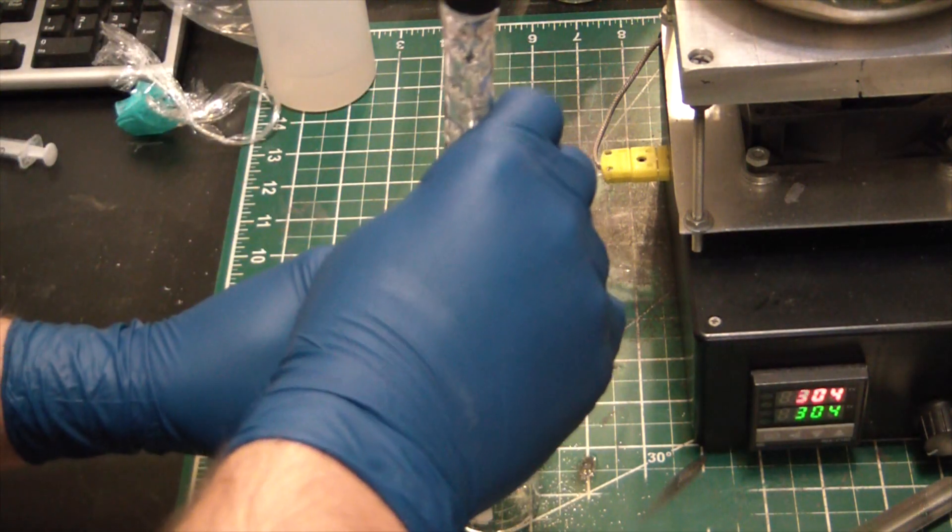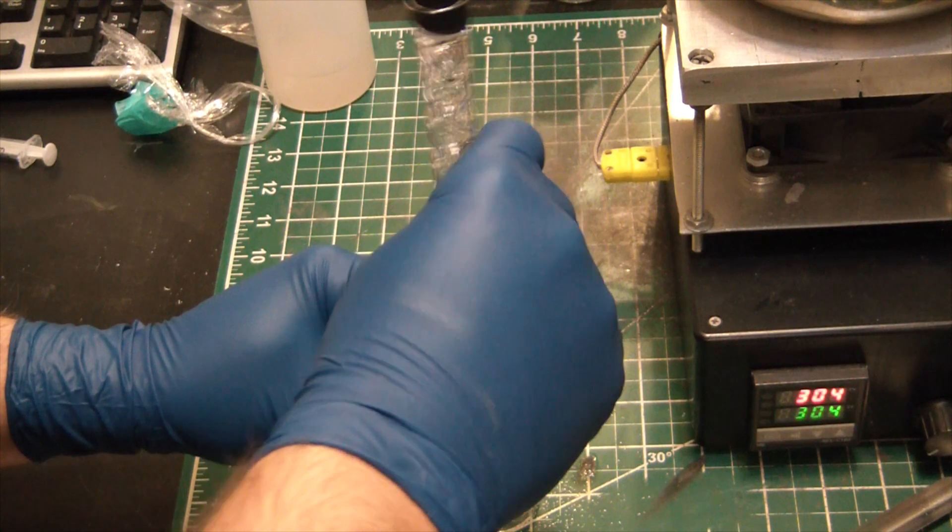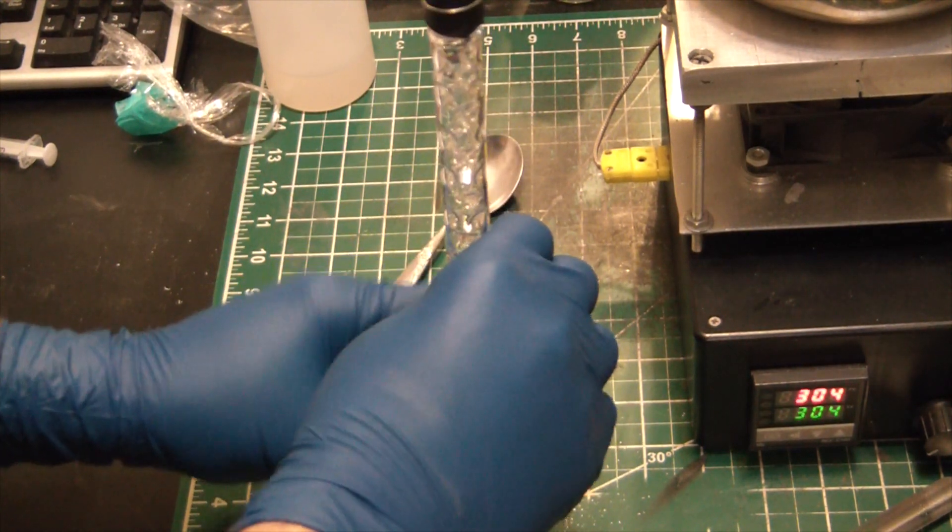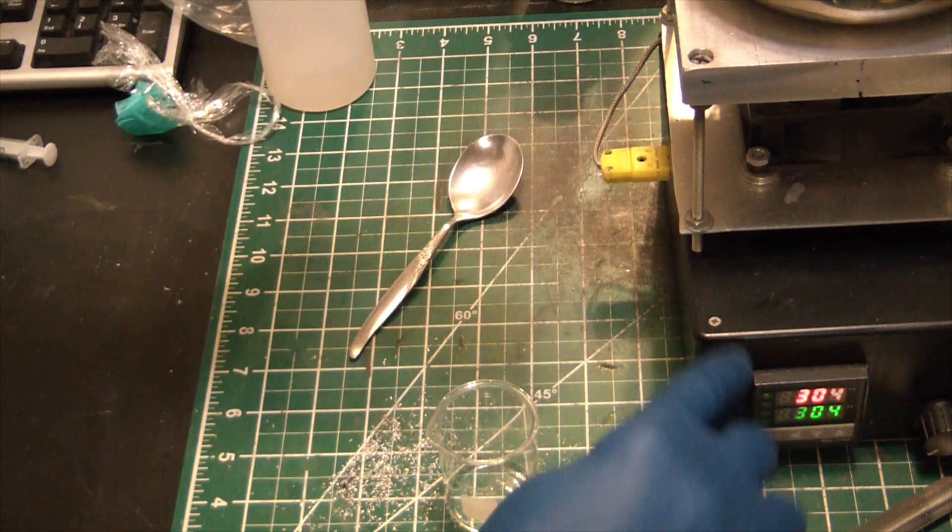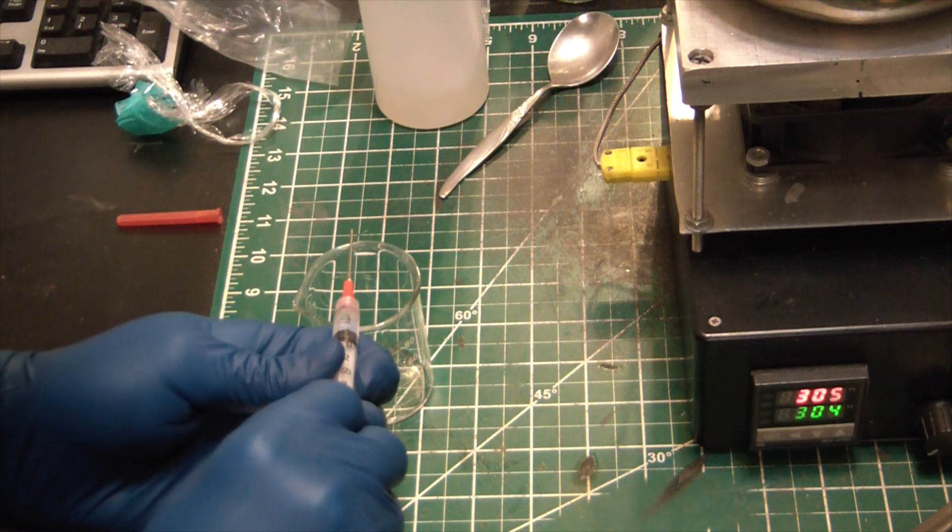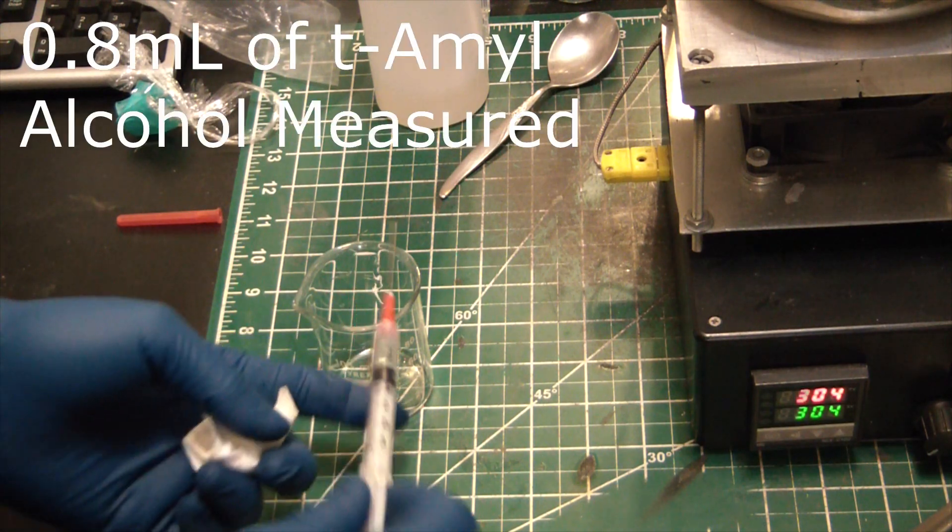Alright, and now we can seal this sucker off. Give it a good turn to lock everything in place and get it on the heat. So I have my hot plate set to just over 300.